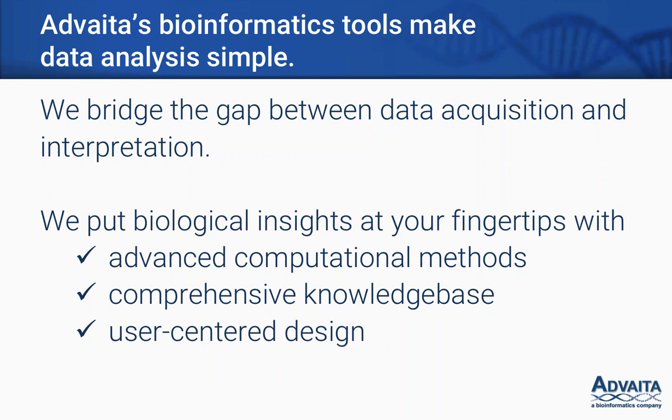Our mission is to help you make use of your next-gen sequencing data. So our tools are designed to help you focus on the biology. We do that by implementing the most advanced computational methods so that you get accurate results. We maintain a comprehensive knowledge base that we upgrade regularly. We just finished an update last week so that you don't miss anything. And we work hard to make sure our applications are easy to navigate so that you can focus on your data instead of getting lost in the software.